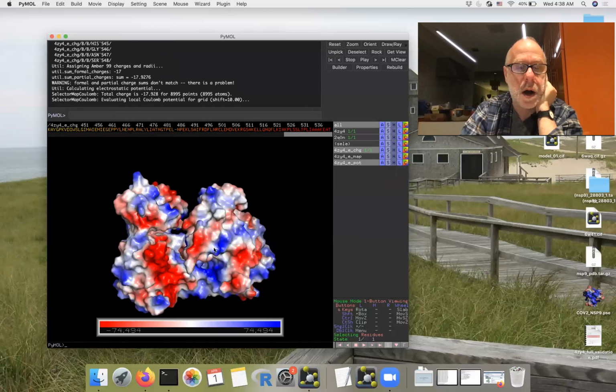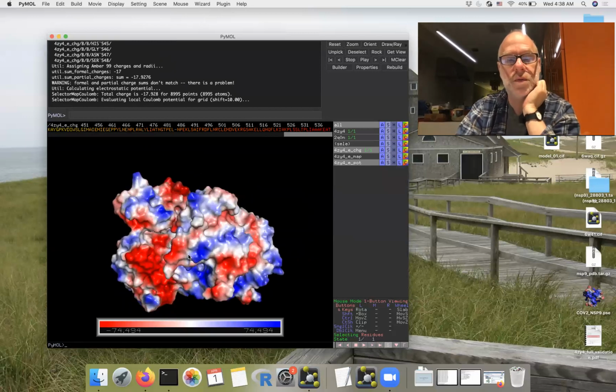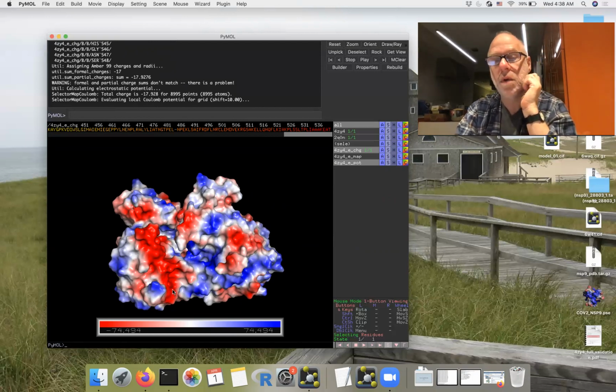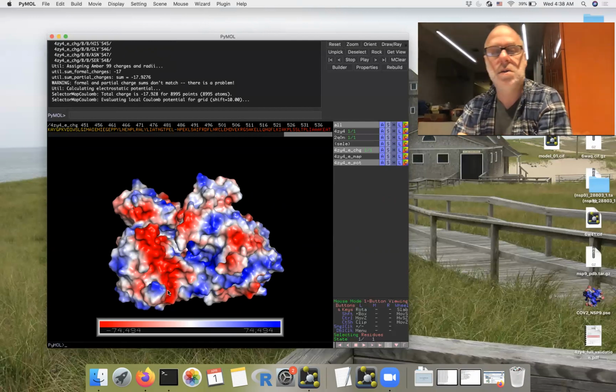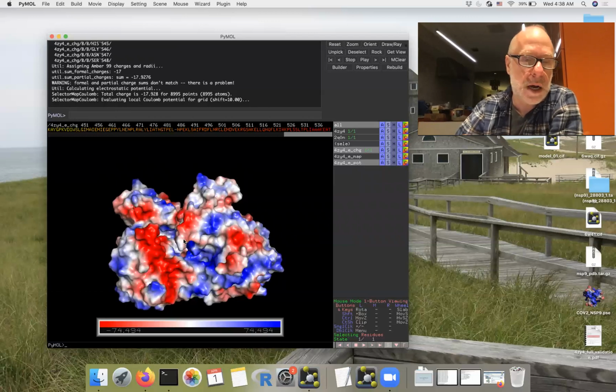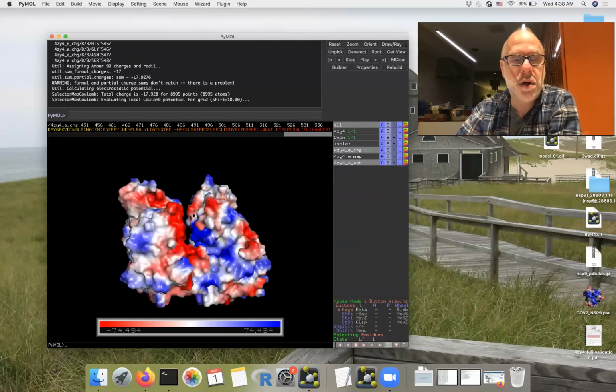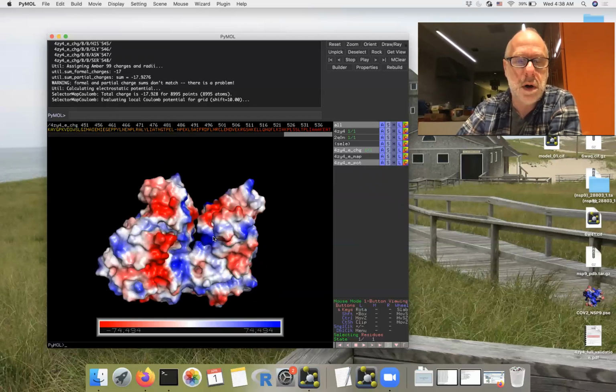There we go. And this is an electrostatic surface of the object. I applied this to 4ZY4, so it's the whole object. And it's a vacuum potential, so it's not the most accurate electrostatic surface, but it does give you a pretty good idea. And basically where the surface is colored red, that's electronegative, usually because of negative side chains or a lot of carbonyl oxygens. And blue is positive, is a positively charged side chains like arginine and lysine, and the negative ones are aspartic acid and glutamic acid. And the white regions are generally hydrophobic or not polar.